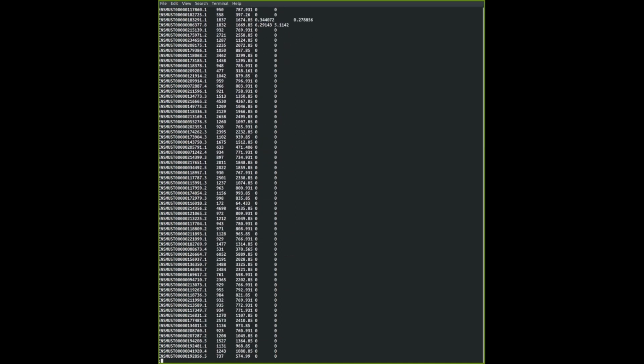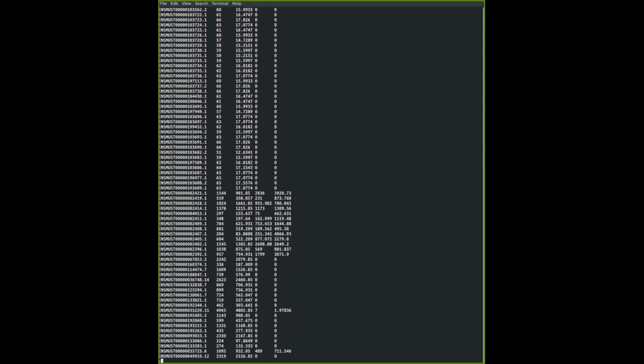So this is exactly what you need for your downstream analysis. So you would typically use the information from the read counts, import it into R, and there are several tools that you can actually use, such as edgeR or DESeq, to quantify and compare the expression of your genes or transcripts from this sample to other samples that you are trying to compare. Right, so you see this is another block of transcript which has proper expression, and that's about it. That's about it that I want to show you.